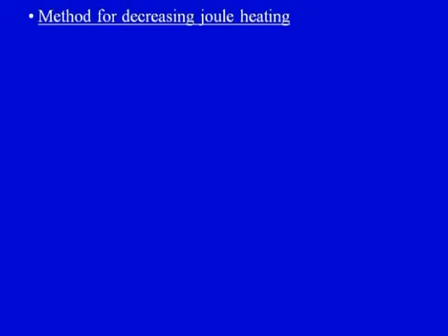Then there will be a decrease in the viscosity of the buffer as the temperature rises or heat is generated, and as the viscosity decreases, there will be a reduction in the resistance of the medium. So, there are several effects which will certainly occur when heating occurs, and they will affect the electrophoresis run. Now, there are methods for decreasing this heating.